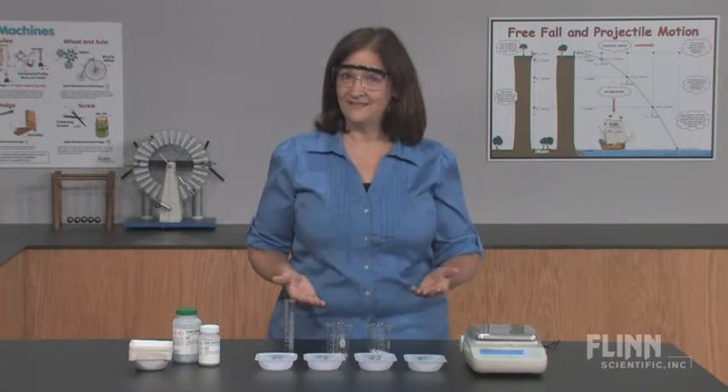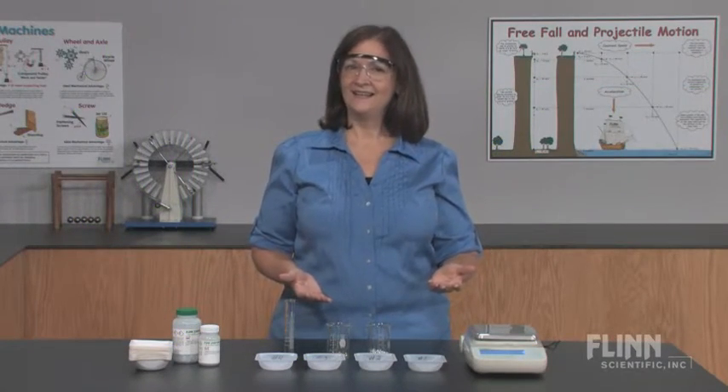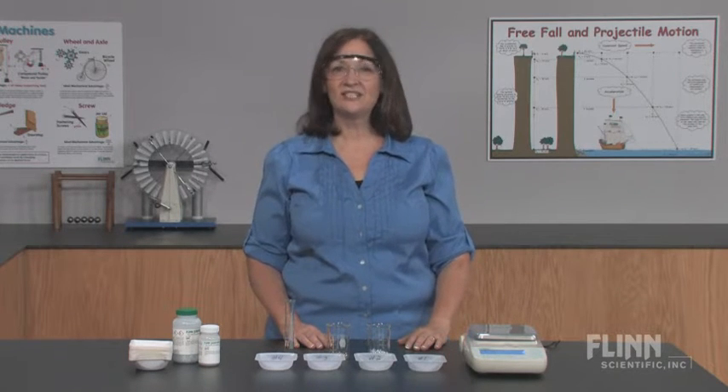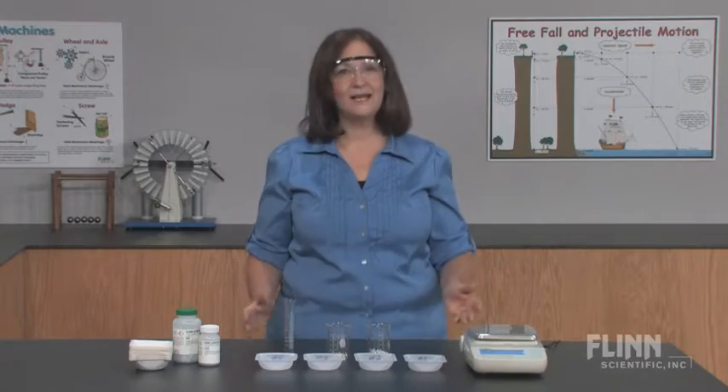Don't just give your students the definition and equation for density. Let them discover the concept for themselves with Flinn Scientific's Discovering Density Super Value Laboratory Kit.